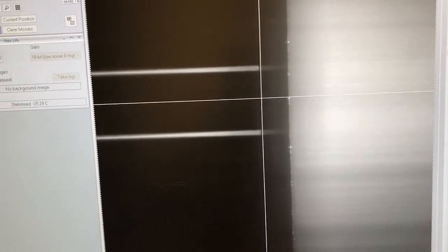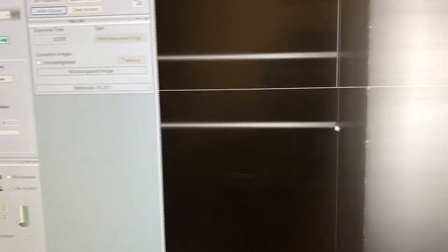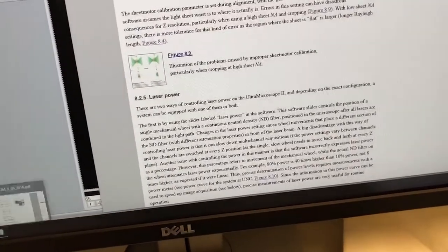I always perform the alignment at a zoom of 3.2. Let's go up to 3.2. We've fallen out of focus — that's typical — and drifted a little in X and Y, also typical because it's not perfectly centered. I'm going to rotate this away from me; as I do that, it comes into focus and then goes back out. I want it as crisply in focus as I can. Because it's too bright, I'll hit the auto adjust button. I can see it's a little blurry — adjusting focus now.